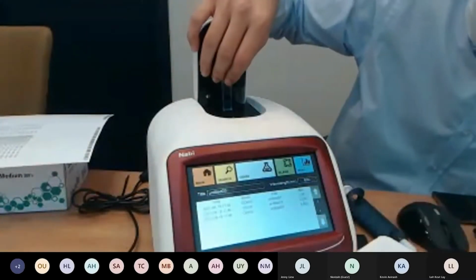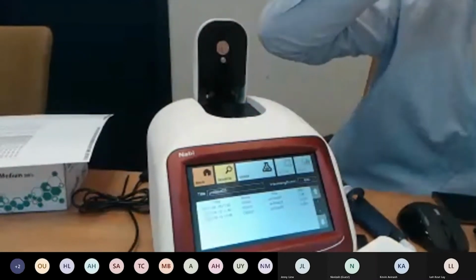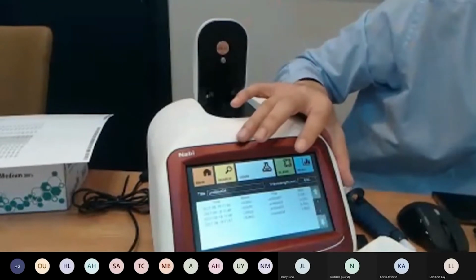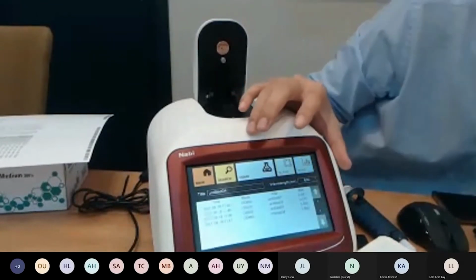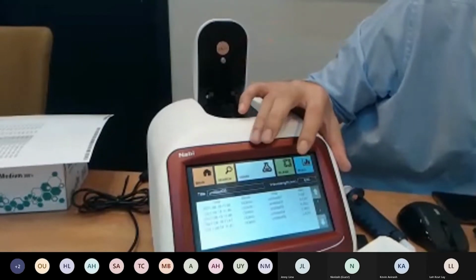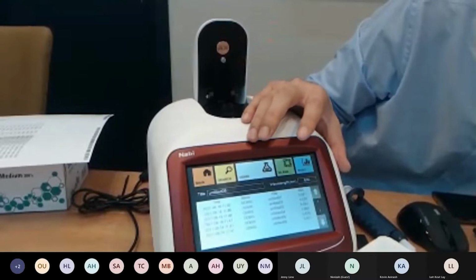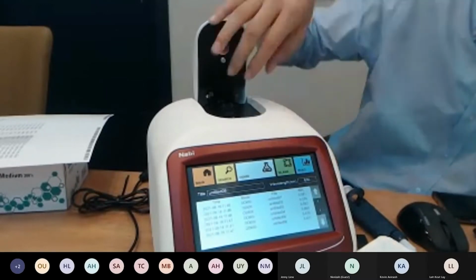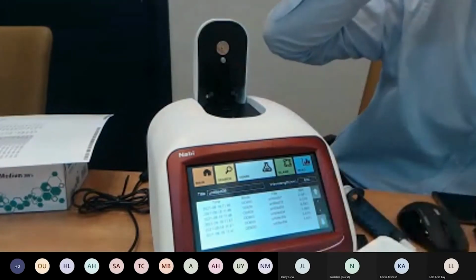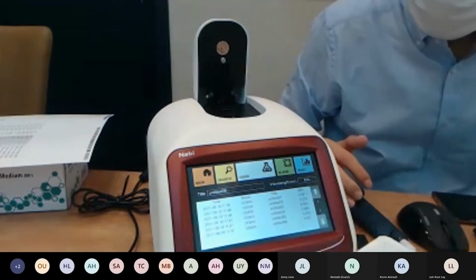And you can see here, to measure this, which should be higher concentration, 0.869, 1, 2, 3, 0.870, 0.871. So very good CV. Should be less than 1%, I'd say. That's it for the cuvette measurements.